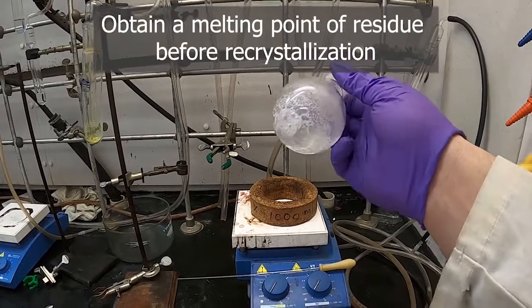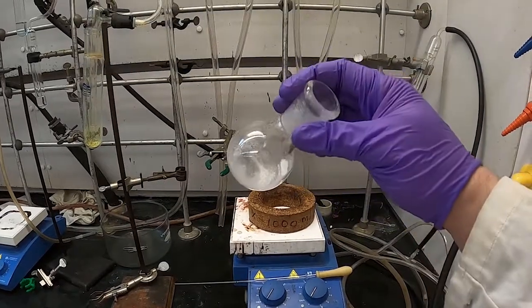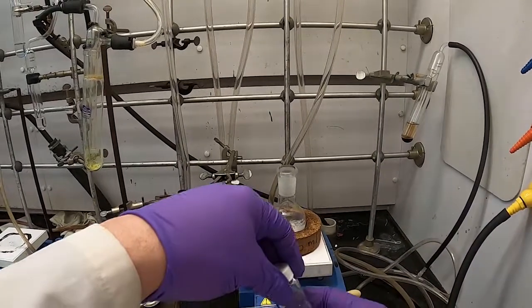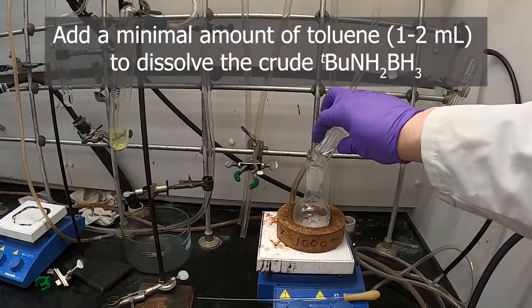So I've got our flask of compound here from the rotovap. We've got sort of this colorless film here on the inside of the flask. So I'm going to add to that. I've got a few milliliters of toluene in this vial here. I'm going to add that to our flask here.